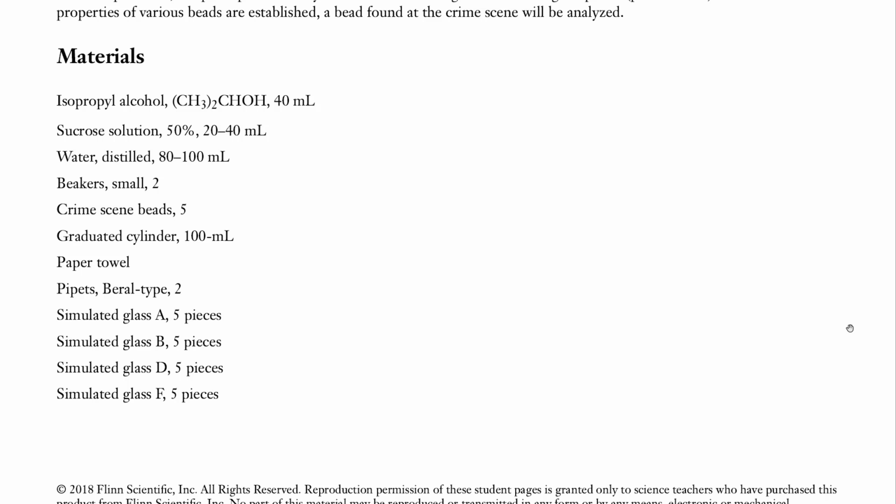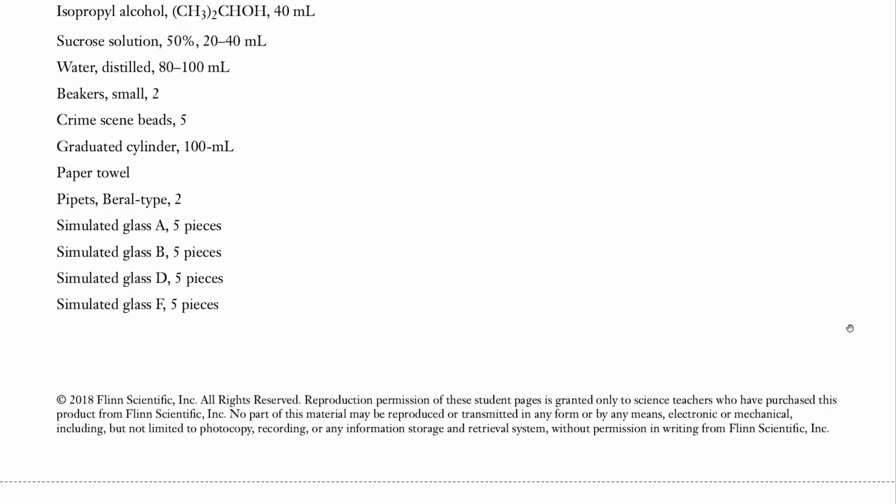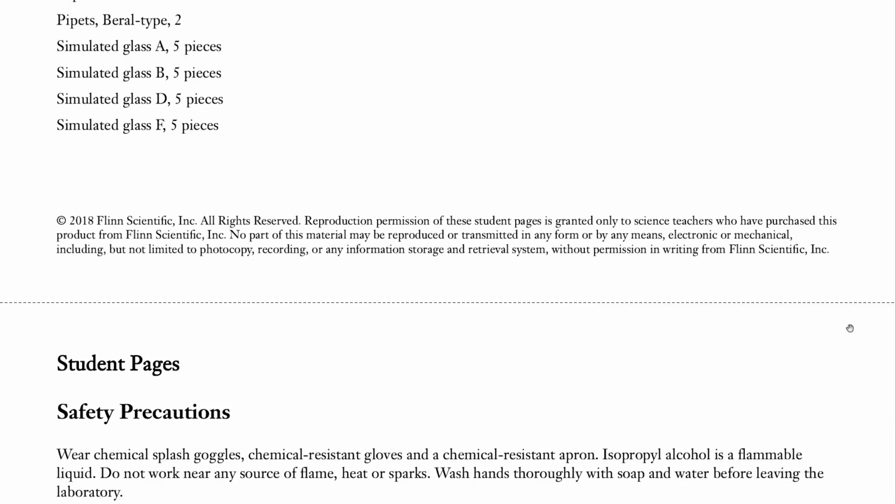So we're going to use this isopropyl alcohol, the sucrose solution, which is the sugar, and we already made that sugar water. We're going to have some distilled water, beakers, some crime scene beads, and graduated cylinders, and some paper towels. Okay.